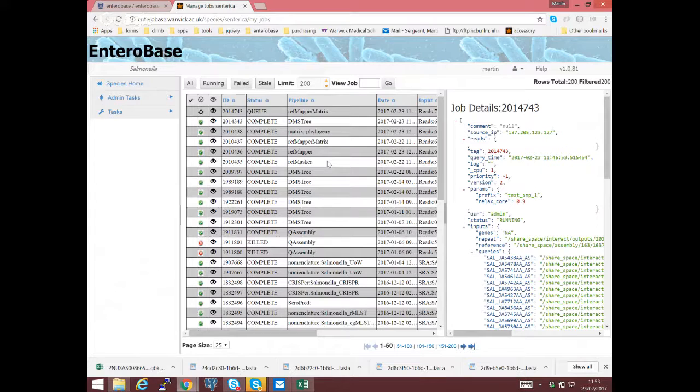Okay, we've just got a question about strain names for text. Yes, there was this problem before, and I think on the latest merge with our source code, it got expunged again. So I need to add that back in. But I will update the changes to the production server today.